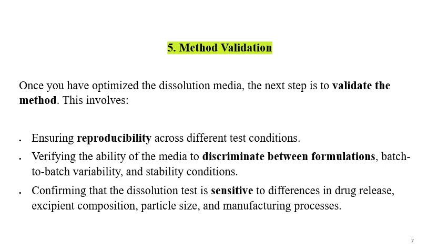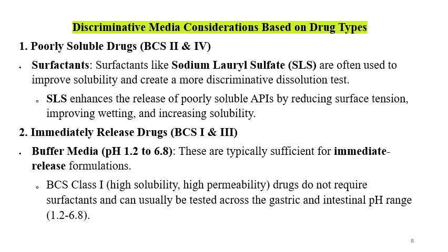This involves ensuring reproducibility, verifying the ability of the media to discriminate between formulations, that is batch to batch variability, and change in the stability conditions or effect of the different storage conditions onto the dissolution behavior. Confirming that the dissolution test is sensitive to differences in the drug release, excipient composition, particle size, and manufacturing processes. So these are the different steps involved in development of the discriminatory dissolution media. You can also refer to these steps for development of the QC release media.